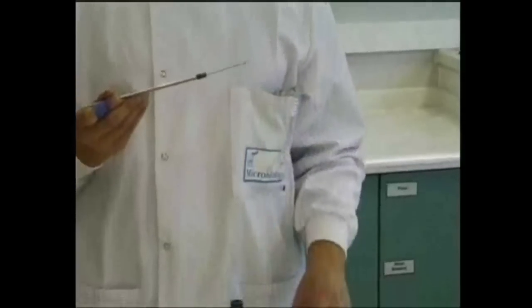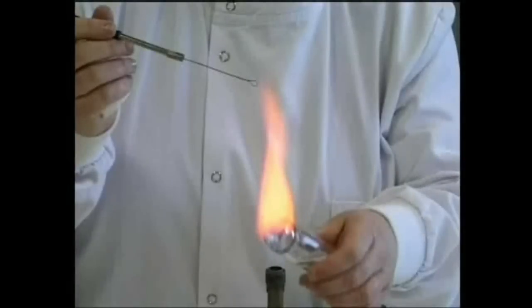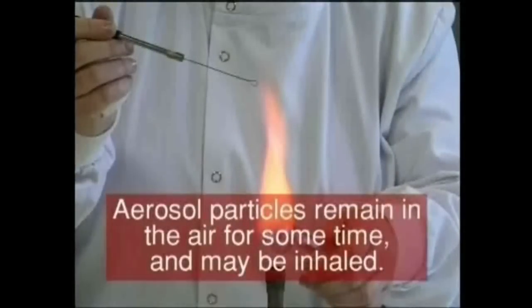Hot instruments not only kill the microbes you are trying to cultivate, but they can also create aerosols. Aerosols are virtually invisible and they can remain suspended in the air for some time. If you inhale an aerosol, you may also be breathing in microbes which is potentially hazardous. Microbe laden aerosols can also contaminate the cultures you are working with.